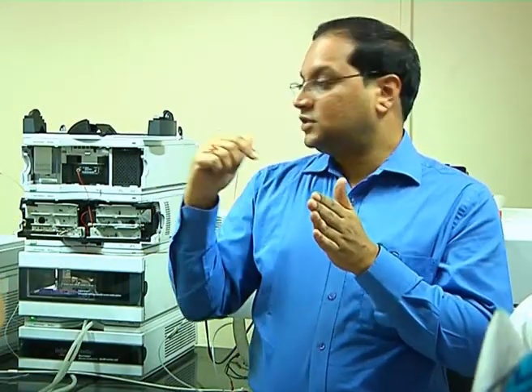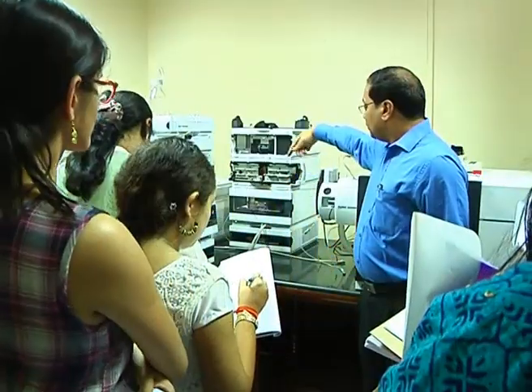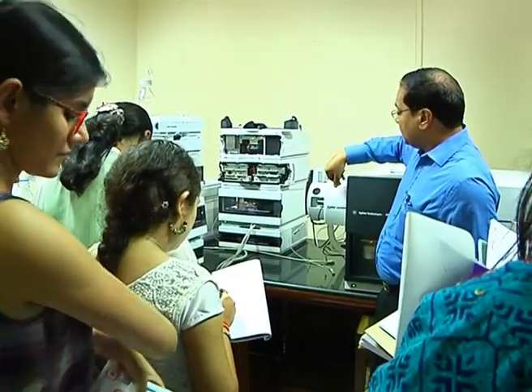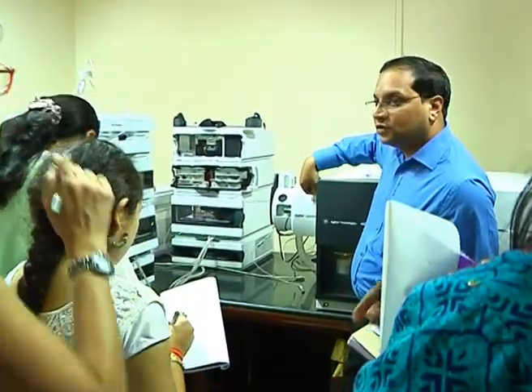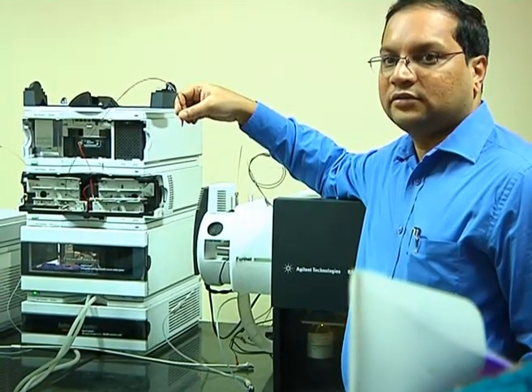What is that? The third dimension given to that analysis is the mass spec, which gives the mass to charge or mass. So when one peak of HPLC goes into the mass spec, it sees beyond those 2 dimensions, which is mass, and it will tell you that one peak is not one compound, there are 100 more masses within that peak. As I told you, it runs through the column and then it elutes in the form of liquid, like this. It is coming like this.